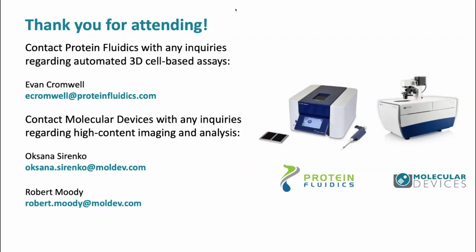We find that's useful if you have smaller organoids or things that might be a little squishy. It also centers them in the well, so it makes it a lot easier for the imaging systems to find them. You don't have to worry about them being in corners or moving around.